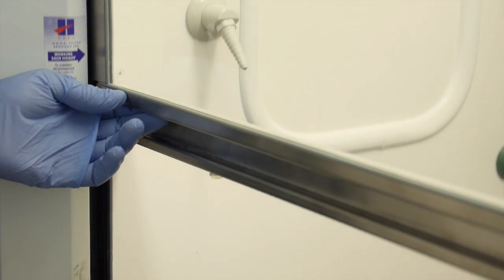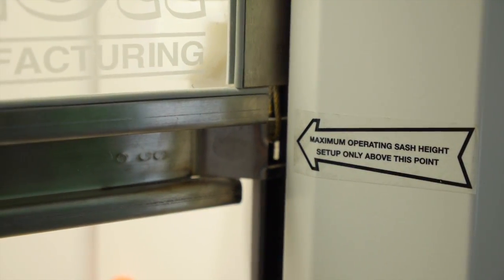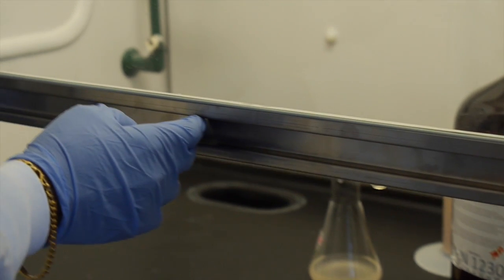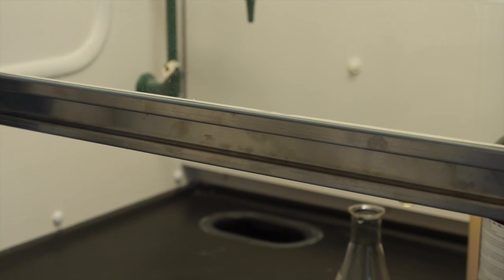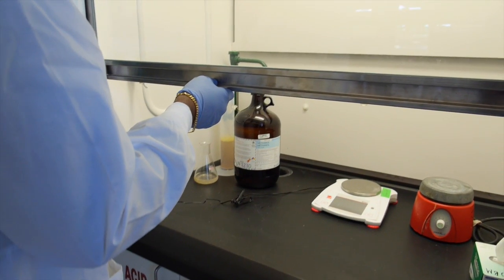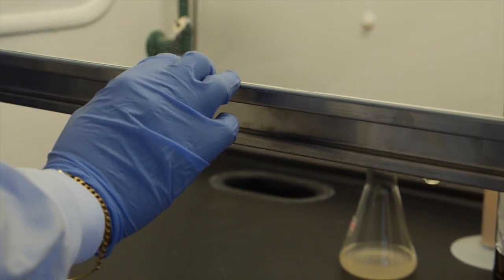Sash. Ensure that the sash is operable. For vertical sashes, the sash is recommended to be set a maximum of 18 inches from the working surface while working in the hood to ensure maximum flow rate. However, you should open the sash only as far as required to perform the necessary functions, as the sash acts as a face and body shield.